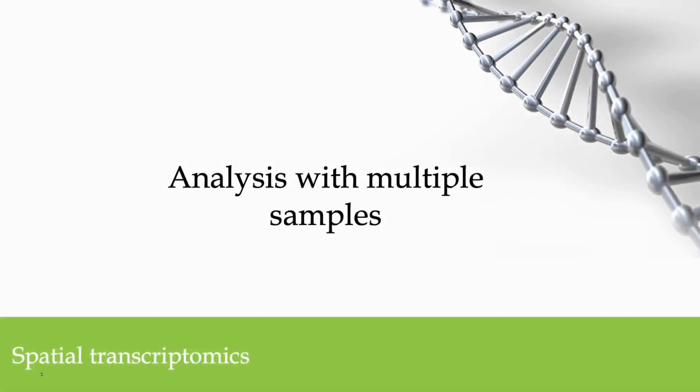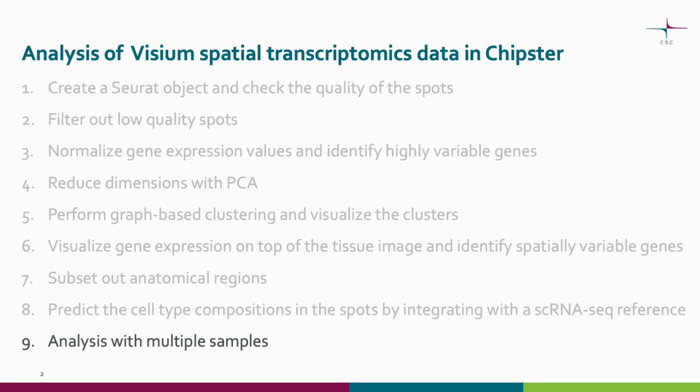In this video, we will explain how to perform the analysis with multiple samples when analyzing Visium spatial transcriptomics data in Chipster. We will go through the key steps and tools needed to perform the analysis with multiple samples.